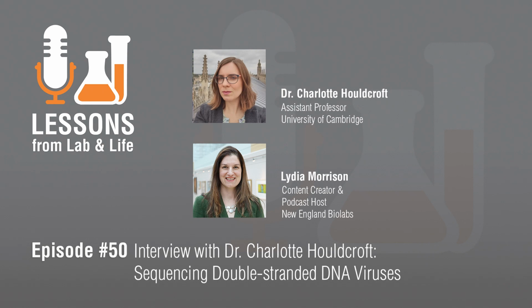Yeah, that's really interesting. It sounds like these methods can be very specific to the needs of the project or the experiment, and they can all be really quite complementary as well. I think it's very interesting about viral sequencing. There's no equivalent of 16S for virology. We haven't, as a field, homed in on one method to rule them all that will be the way that sequencing goes in the future. I don't know whether we will ever get there, or whether we'll continue to use all of these methods and new ones that perhaps are being developed at the moment. But it's great to have a toolbox.